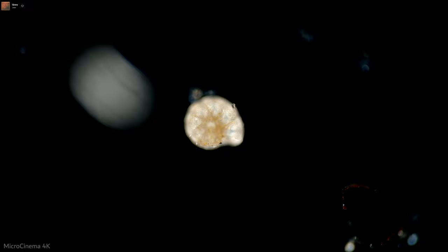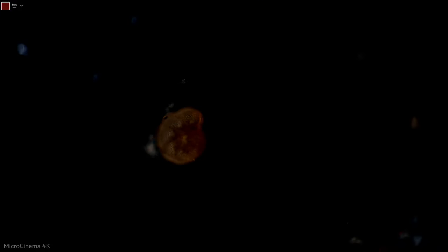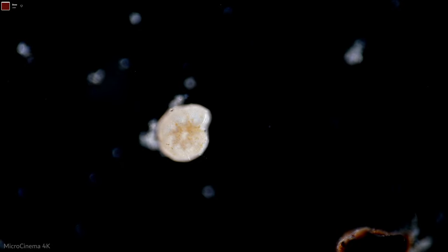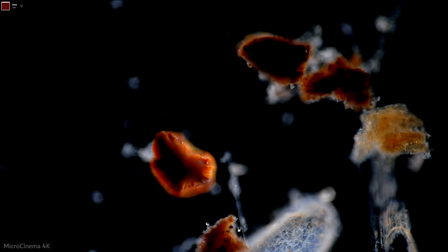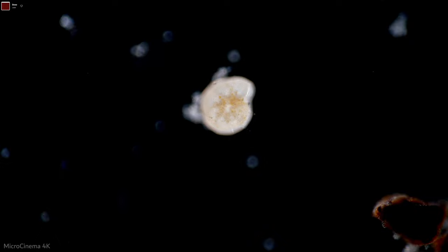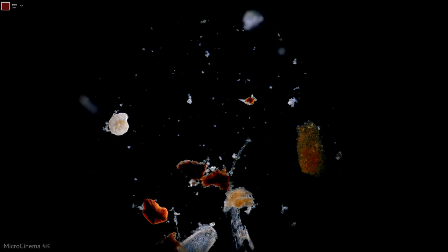But yeah, forams are single-celled organisms, and I guess they're typically lumped in with the amoeba. And they build these shells, which sometimes look like snail shells. Like this one kind of looks like a snail shell. But other times, they're more globular and kind of messy looking. It really looks almost no different in Darkfield here. But this is just really cool. There's a lot of people that study forams. They're important little fossil organisms, because the shells stay around for a long time.